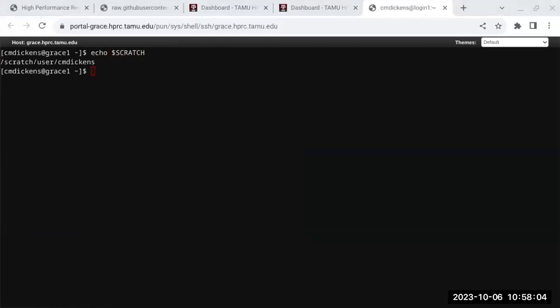Don't put spaces in directory names. Sometimes people name their file on their Windows computer with spaces and they upload it to Linux and it has spaces in it. It's going to haunt you later. So don't use spaces, use underscores or even dashes. I need to correct this slide, but let's just do this. mkdir $SCRATCH/NGS_class. All right. There's no error. If I already had the directory, it'd say, hey, this exists. Do something else. cd $SCRATCH.